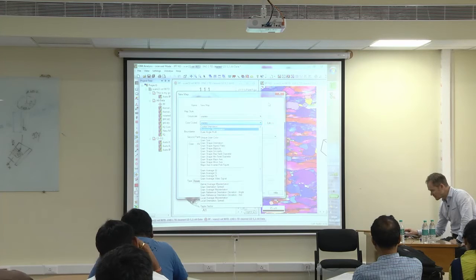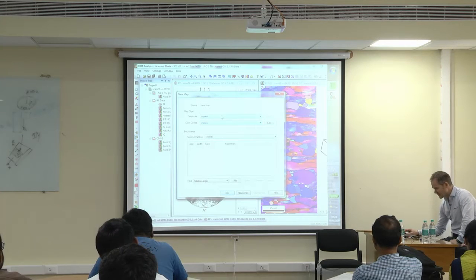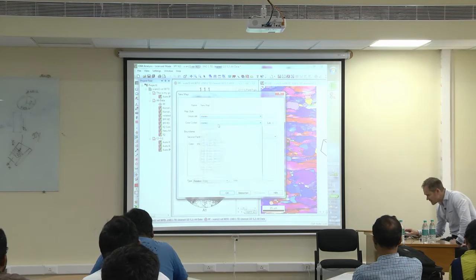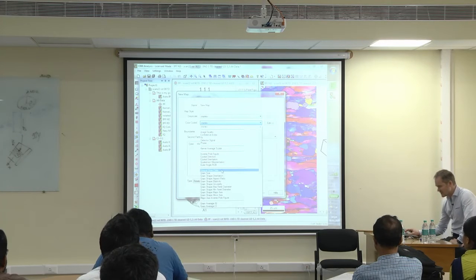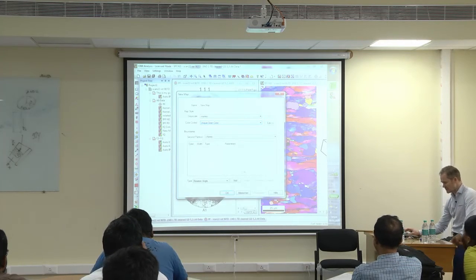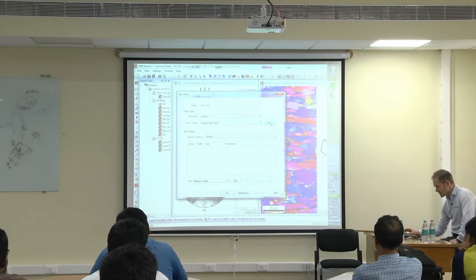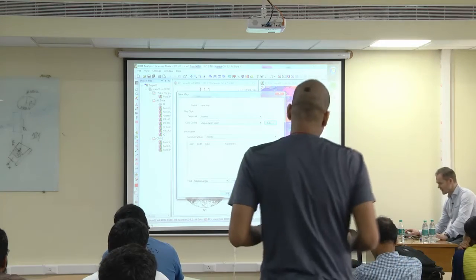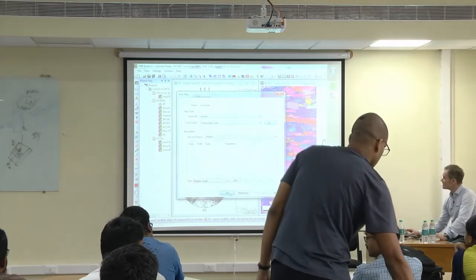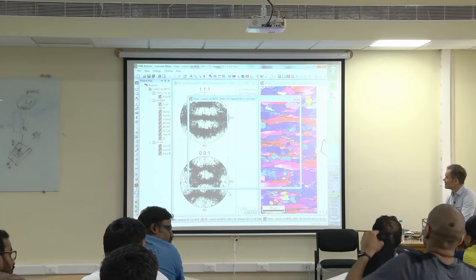And so let's do something different before. Let's first make a plot which shows us crystals with unique grain color. So unique grain color will show me... why is it not ready? Oh yeah, no, that's correct. So let me plot that, unique grain color.